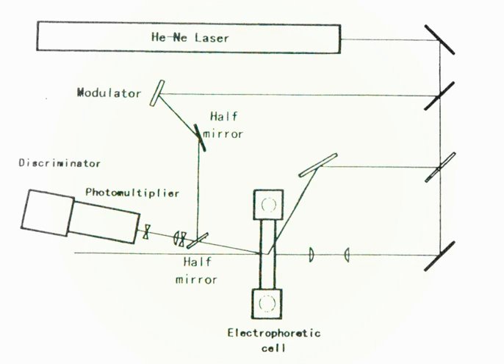Figure 5 shows heterodyne power spectra obtained by Fourier transform of the autocorrelation functions shown in Fig. 4. Figure 6 shows plots of Doppler shift frequencies measured at various cell depth and electric field strengths, where a sample is the NaPSS solution. These parabolic curves are called profiles of electro-osmotic flow and indicate that the velocity of the particles changed at different depth.